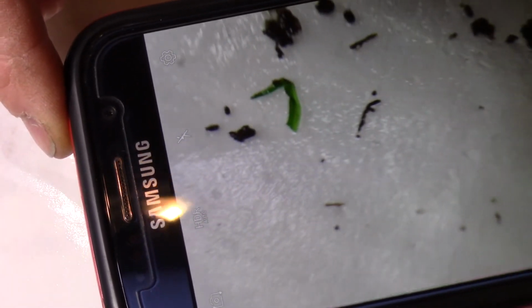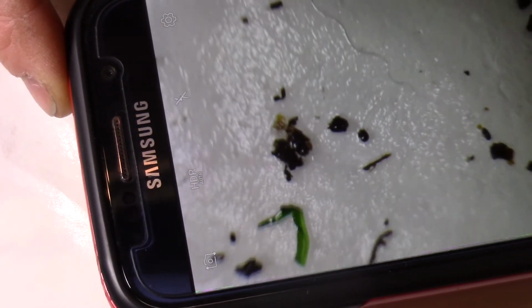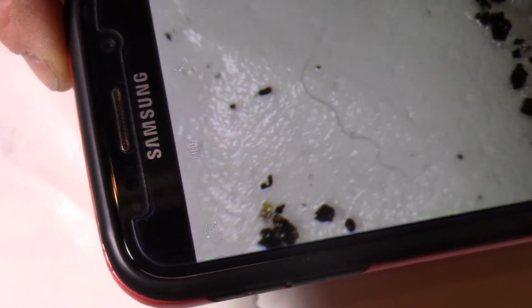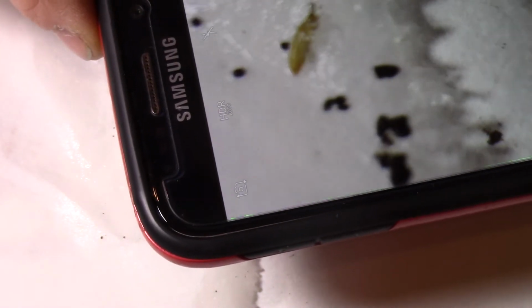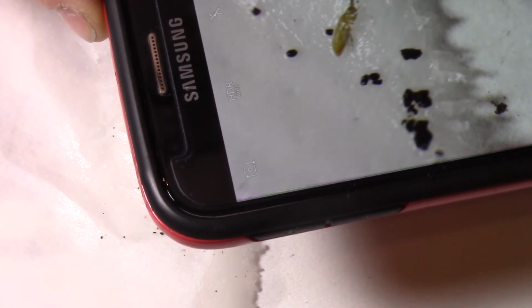So far, everything just looks like dirt. I think that's a green microplastic from the avocado bag. There's a hair. It looks like a dog hair, not a human hair. Ooh, what's that? That looks like a springtail, maybe.